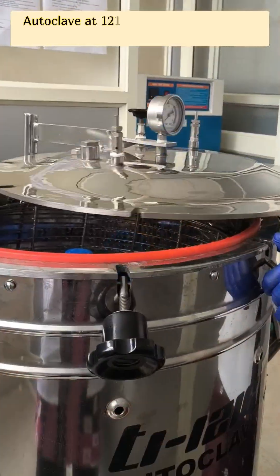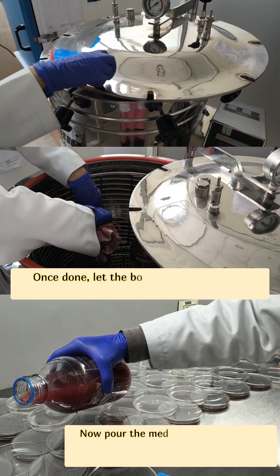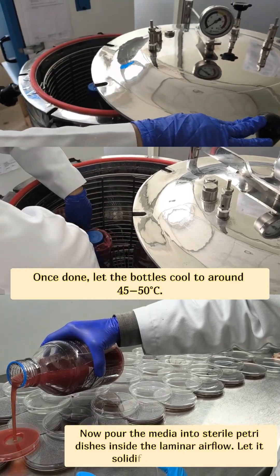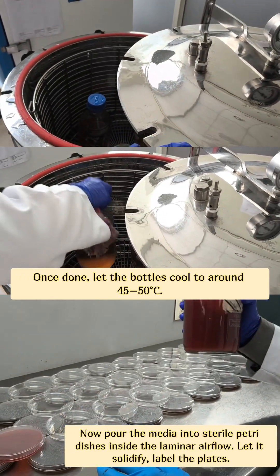Autoclave at 121 degrees Celsius for 15 minutes at 15 psi. Once done, let the bottles cool to around 45 to 50 degrees Celsius. Now pour the media into sterile petri dishes inside the laminar air flow hood.